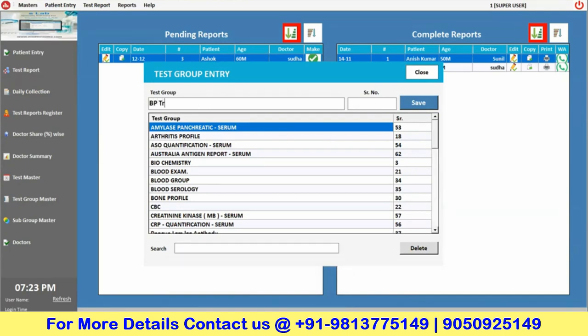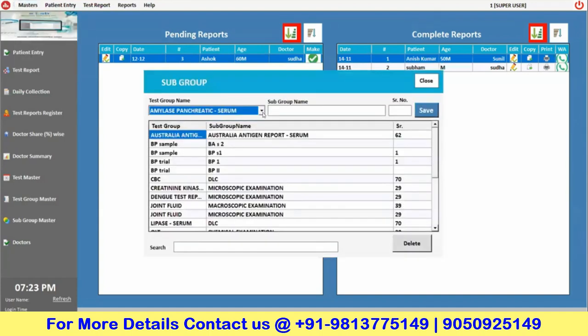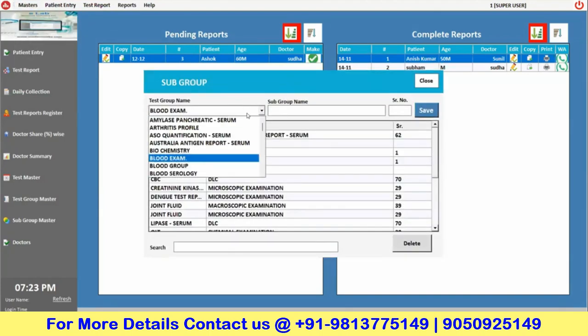I'm adding BP trial here, and if you want to give a serial number, I'm giving 100 to this, and then click on the save button. So this is the procedure of creating the test group entry. And if you want to add a subgroup of BP trial, you can add that option also with the help of subgroup. So I need to add the subgroup in BP trial.